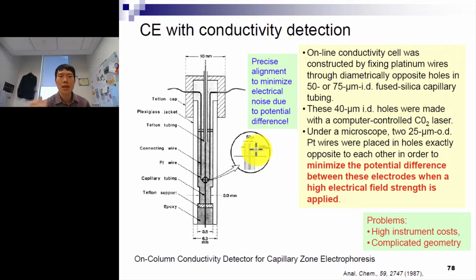As chemists by training, we don't have to look so deeply into the engineering parts. But as a whole, I want to summarize that this instrument is very expensive and has a very complex geometry, which means that if there's an error or data that looks a bit off, I don't think a chemist can repair it so easily.